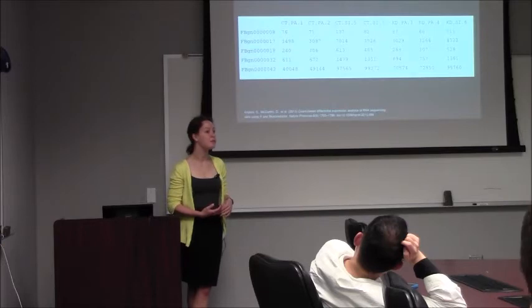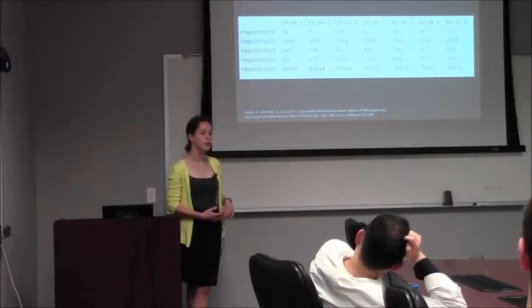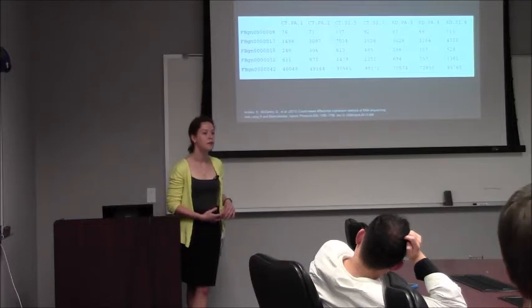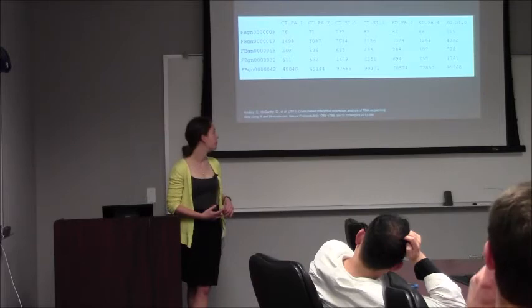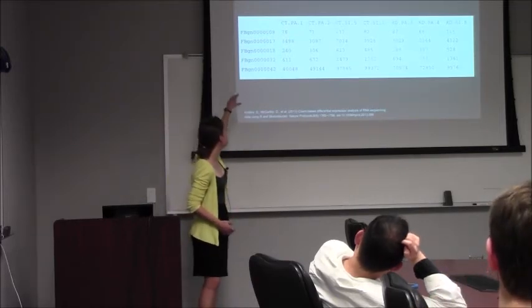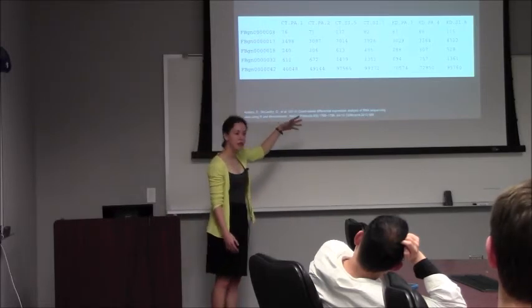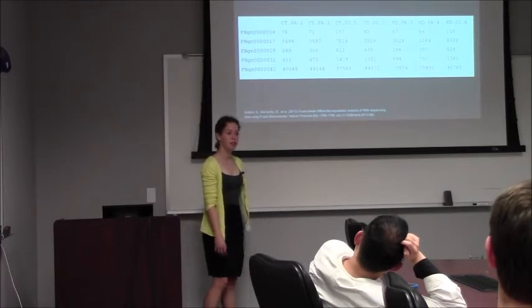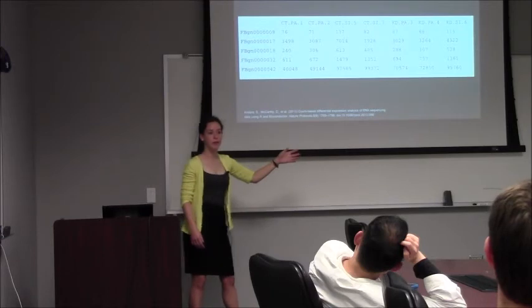My follow-up to this question: this is the data set that goes into the model, so are our observations genes? Is that the right way to think about it? You're doing a test for each gene, so your samples would be your observations. These are all the Y's in one row.